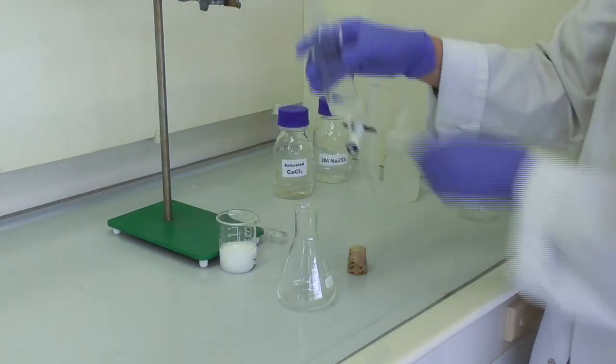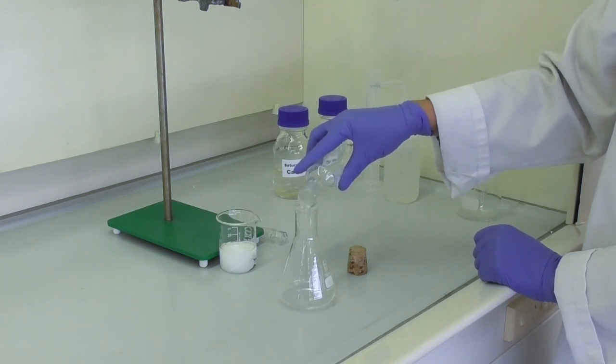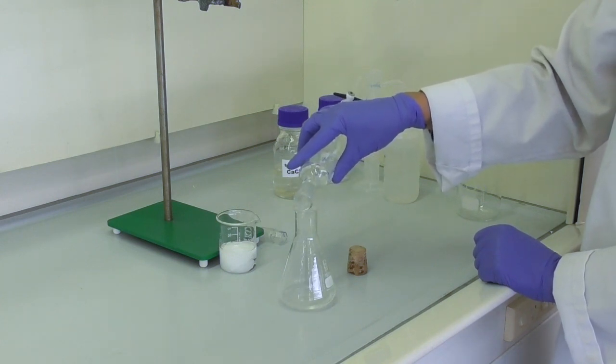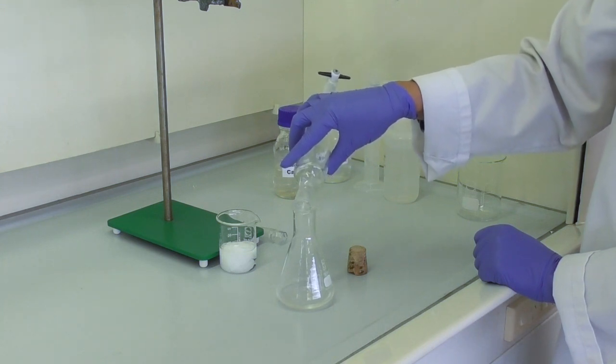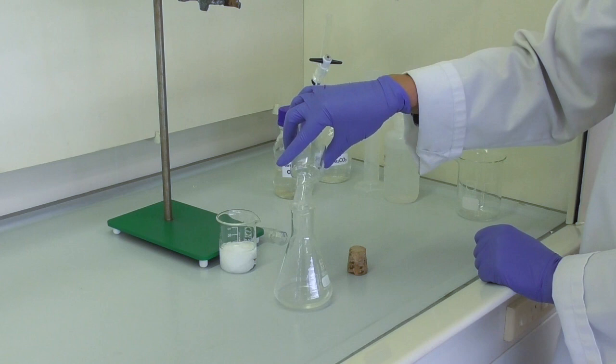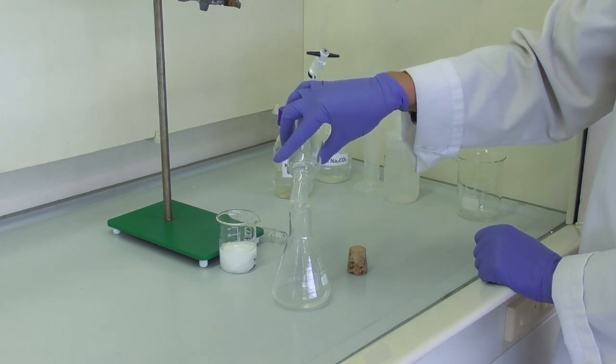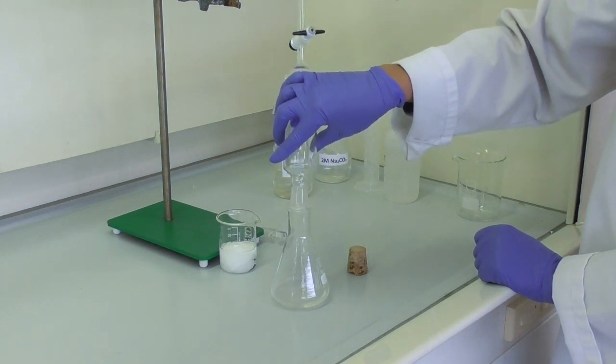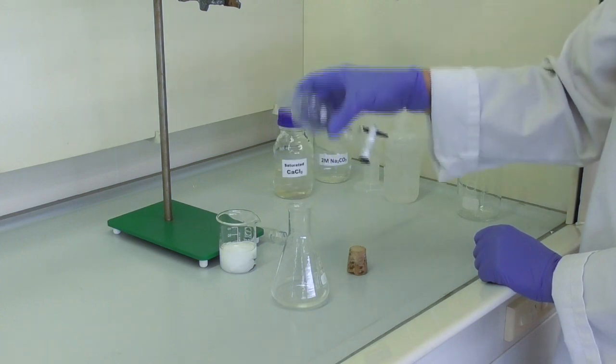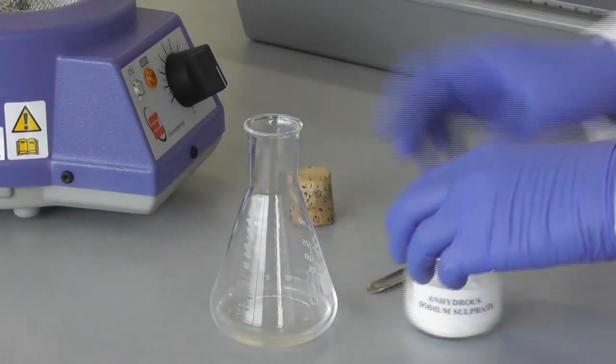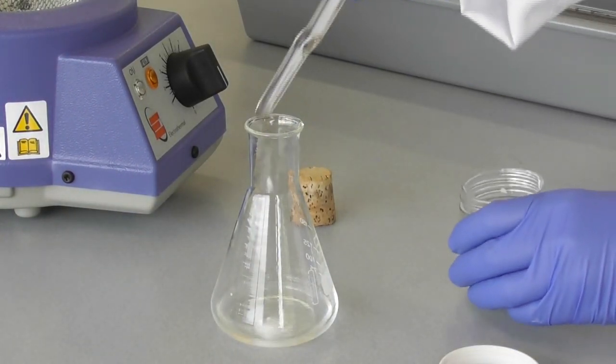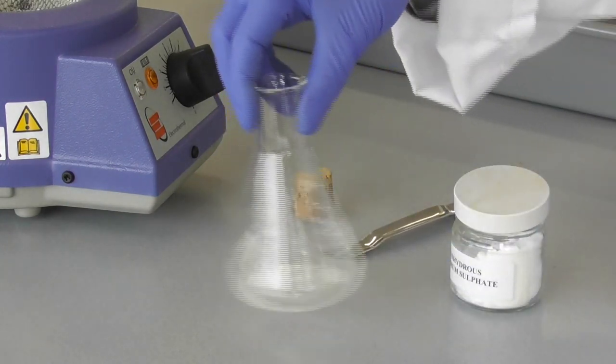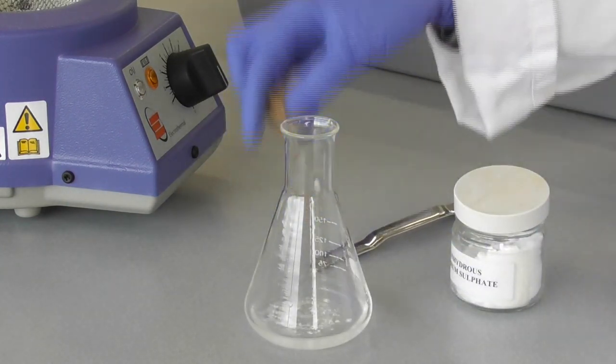Now that we are done with the washing process, we pour the remaining organic extract into a dry conical flask, stopper the flask, and take it to the bench. Since we have already added a drying agent, this does not require a lot of sodium sulfate. Usually a spatula full will dry the solution completely.